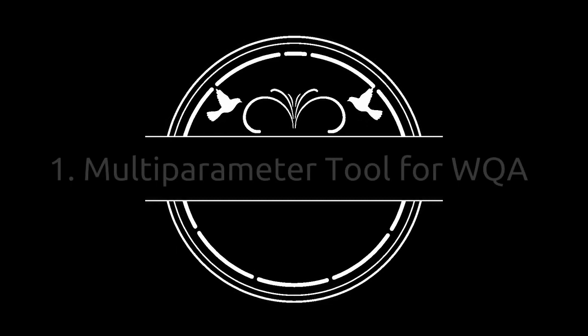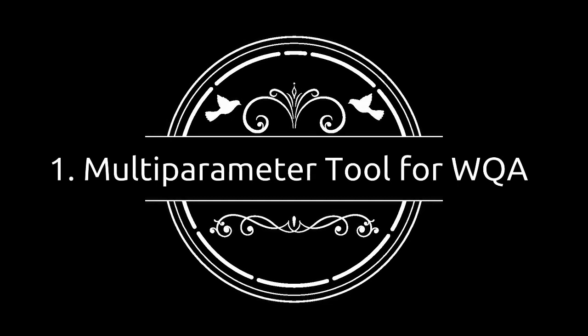But at the same time, we can go for estimation of these parameters by using some devices, and these are called portable devices. These devices can be used directly in the water, and we can get a reading and note it down for analysis. We have a few of the devices in our laboratory that we want to give a demonstration of to you.